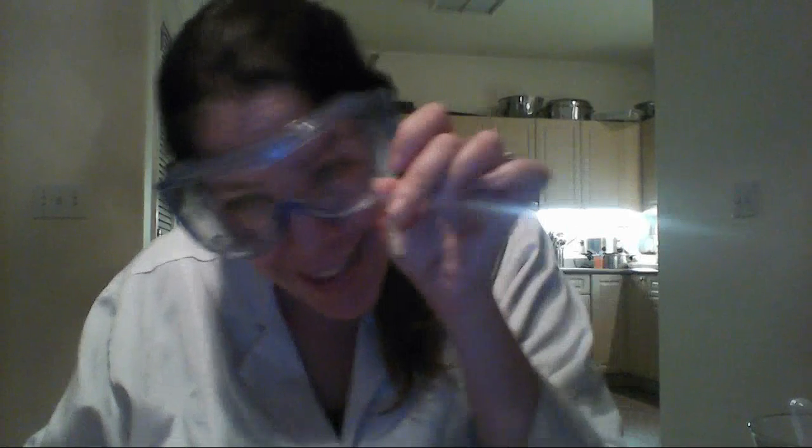You can use a necklace chain. You can use leather string, whatever you like. Just make sure it's big enough to stick over your head or the head of whoever you're giving this to. And so I'm going to tie this. And now we have the latest bio fashion here. I'm wearing my DNA close to my heart. And again, you could give this to your loved one. What better way to say I love you than giving them your entire genome?